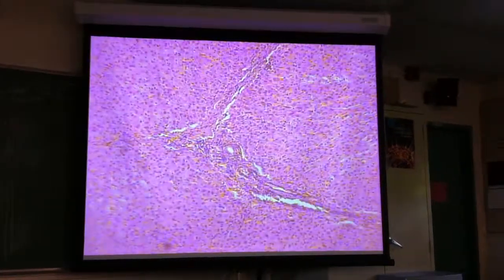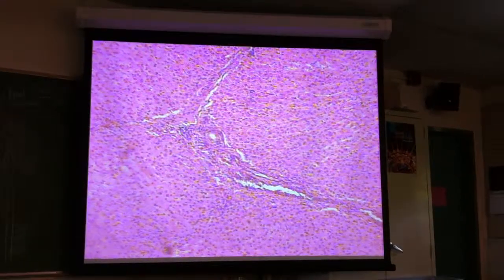So I can see faintly the connective tissue elements already. They're kind of subtle, but you can see right in the center of the screen there's a junction where connective tissue elements are coming in from three directions. That possibly could be a good place to look, although actually I can see some right here under low power. So I'm going to zoom in on this area.